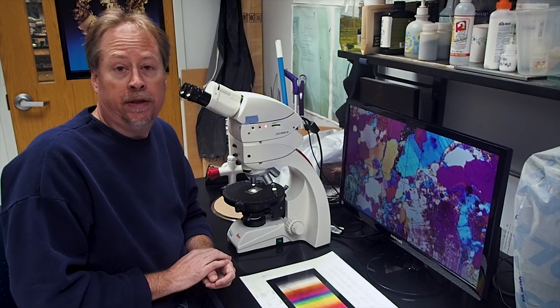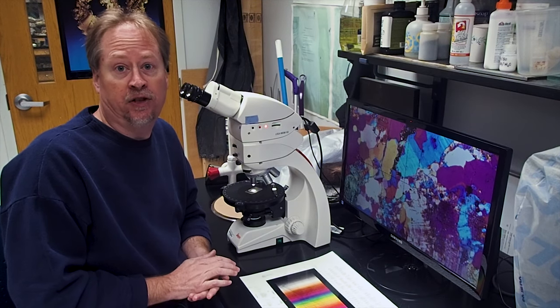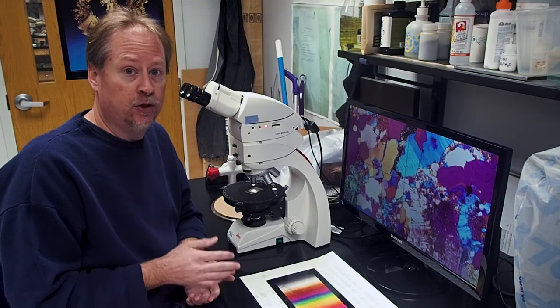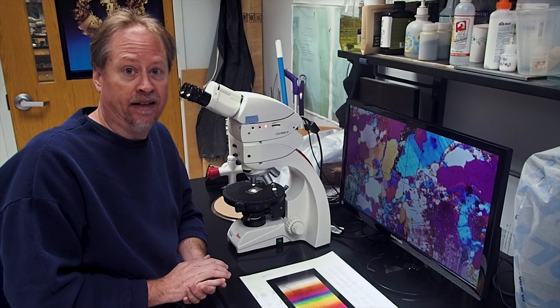If all goes well, you will have successfully prepared a rock thin section suitable for viewing and petrographic analysis. The only step remaining now is to preserve and protect our thin section by adding a glass cover slip.